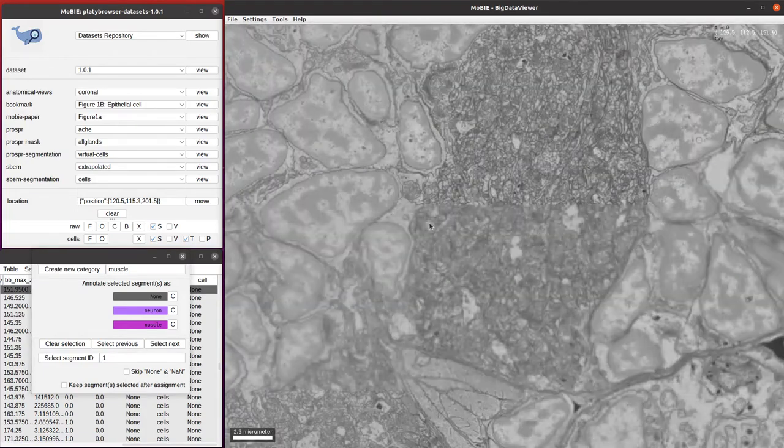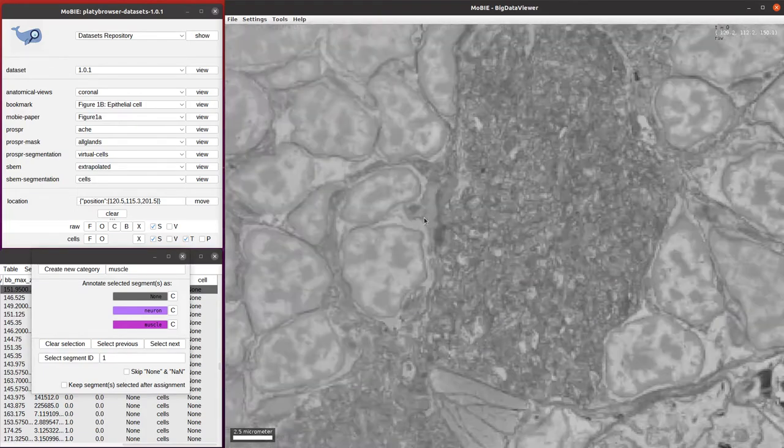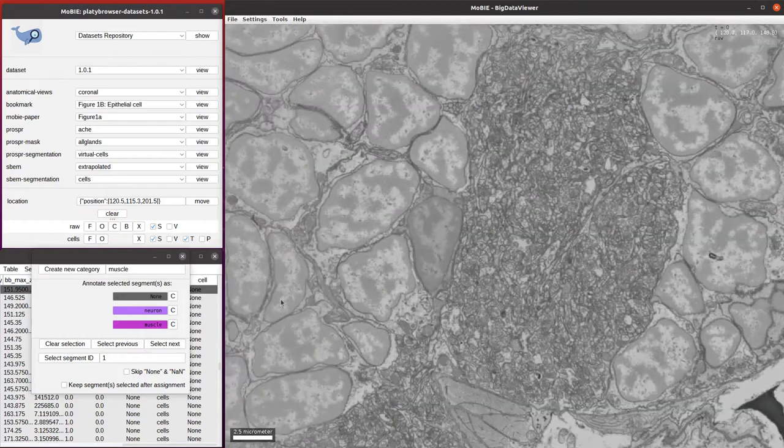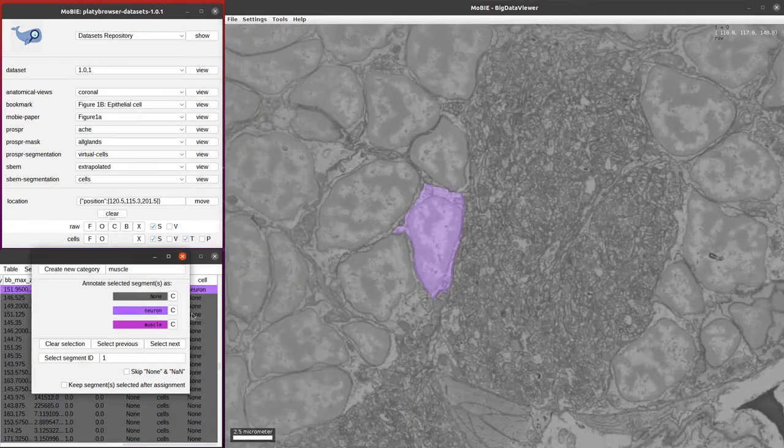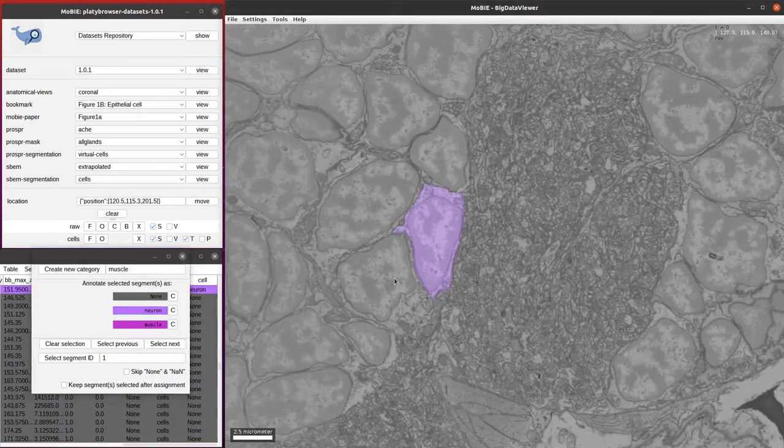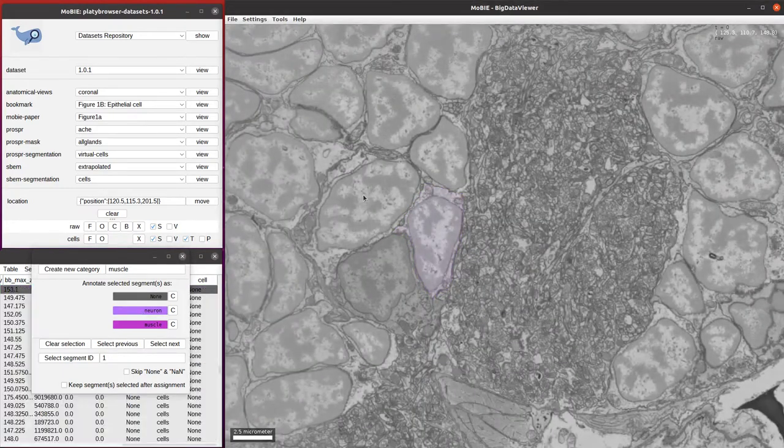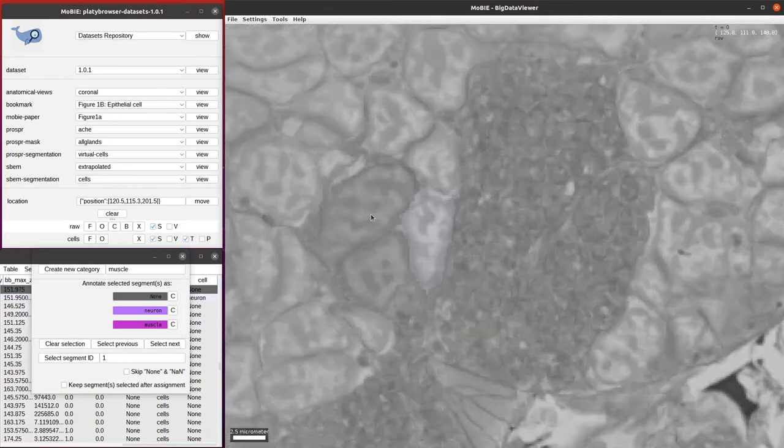We're in the head region of the Platynereis, so it makes sense for it to be a neuron. We can just click the neuron button and we see that it gets assigned the right color.